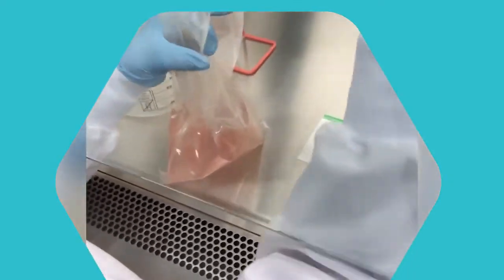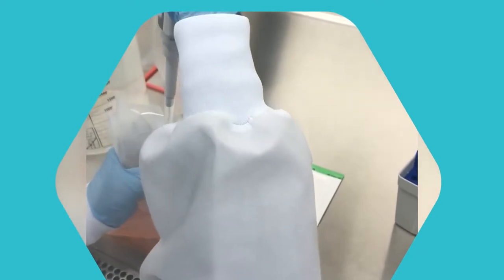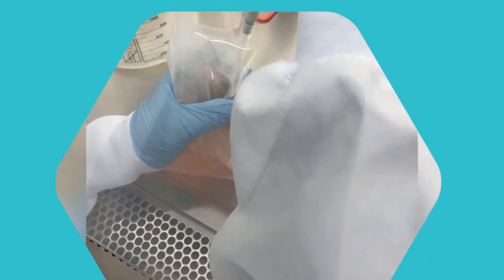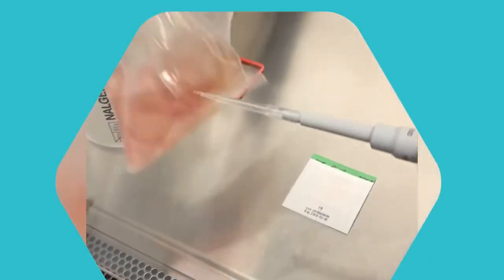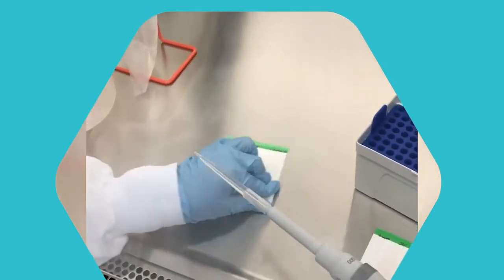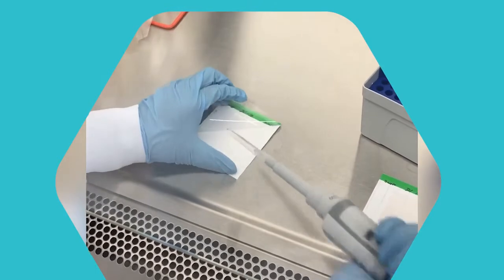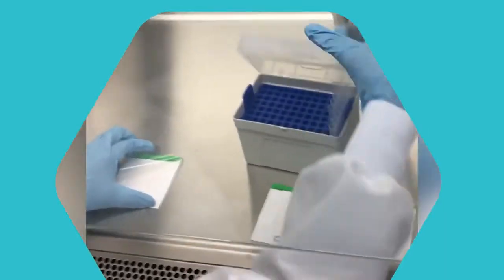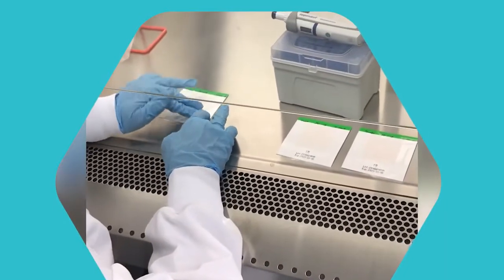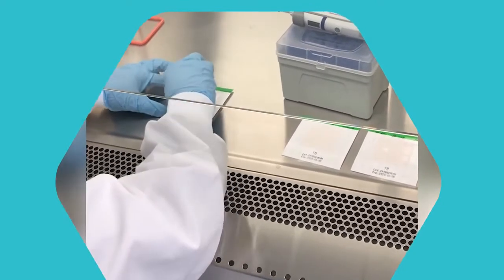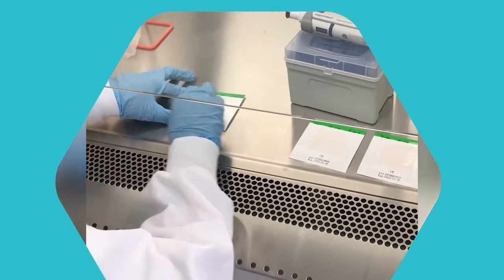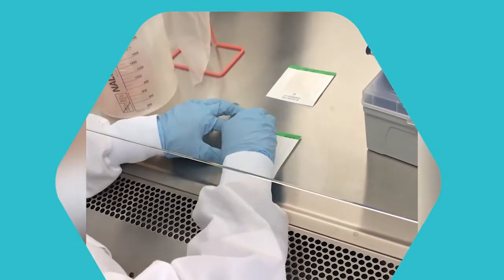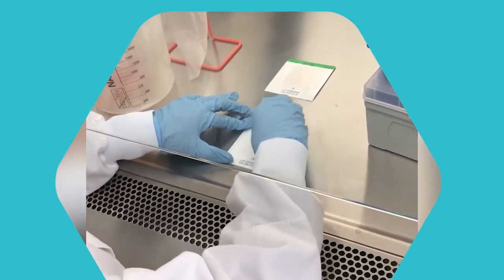We're going to do the last sample. What we're going to do is secure the surrounding before it goes in the incubator. So we take out any air bubbles that don't interfere with the growth of the pad and the microbes.